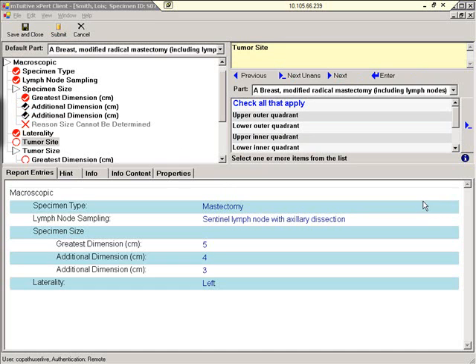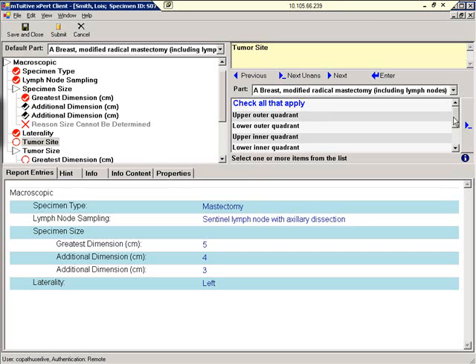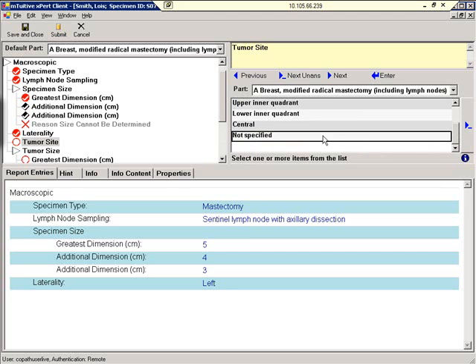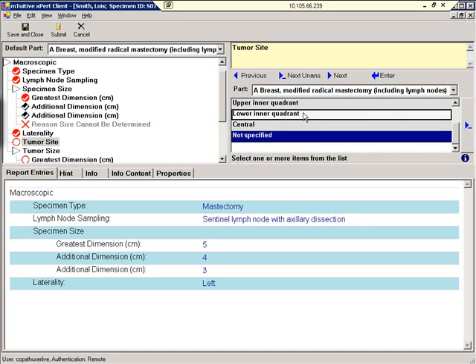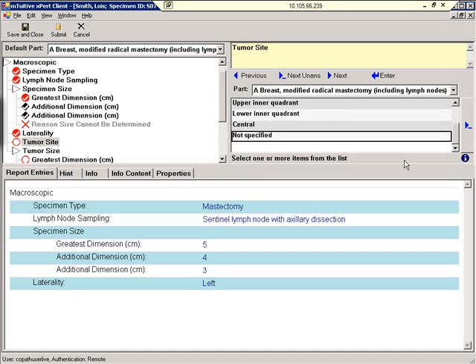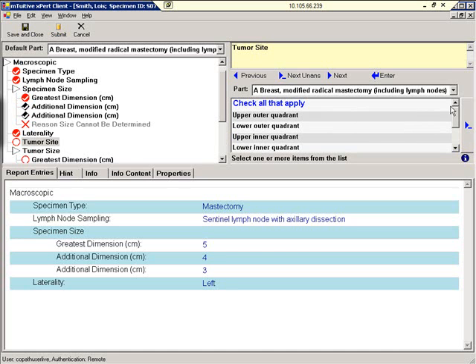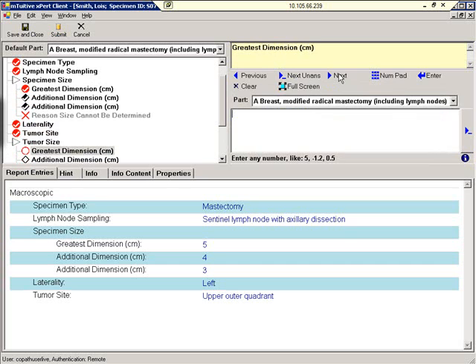The intuitive expert system is running in the background. It's smart enough to know that in regards to this specific field, multiple pieces of data can be accepted. The expert system also prevents the end user from selecting multiple pieces of data that do not make sense. For example, we'll select not specified and also try to select lower inner quadrant. As you can see, the system will not allow this. We must deselect not specified before making another selection. We'll pick upper outer quadrant.